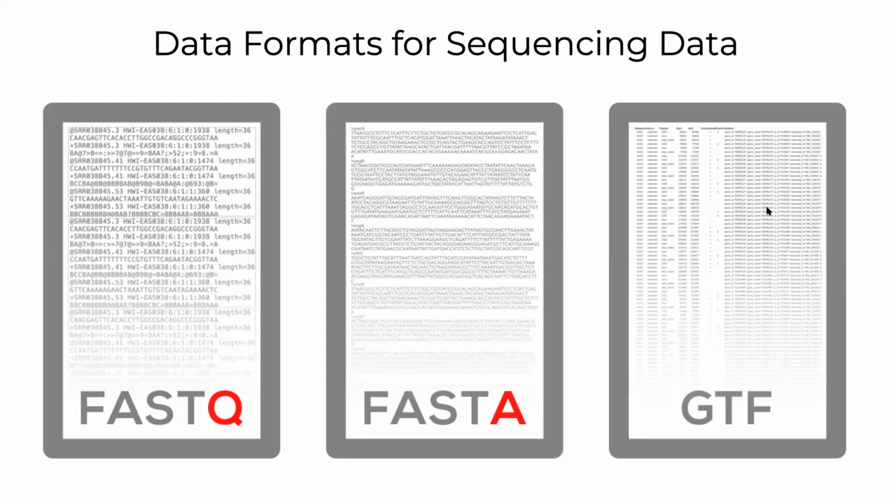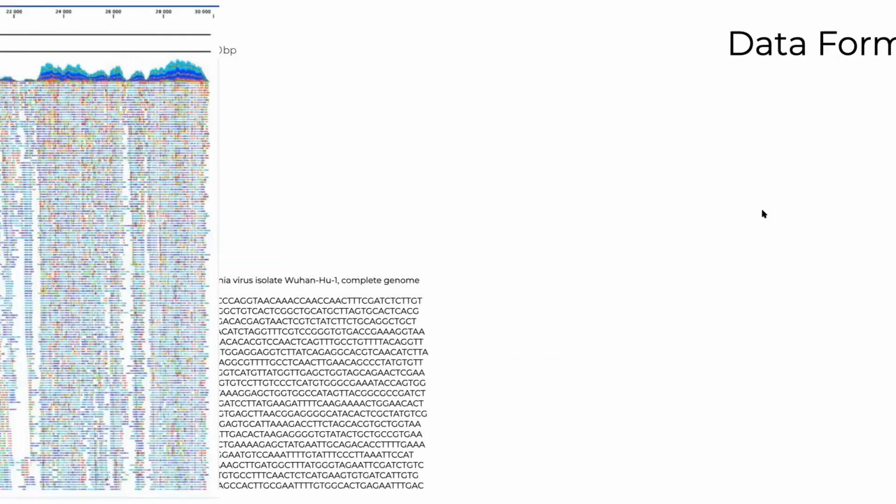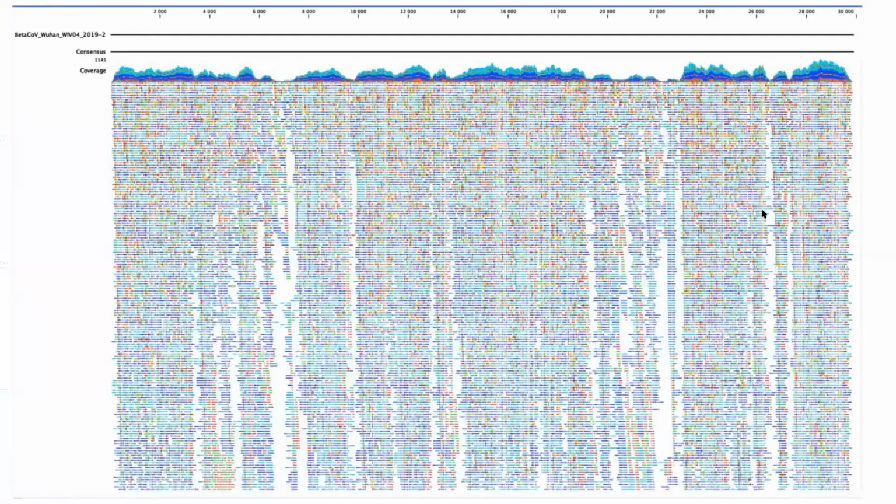When we are talking about SARS-CoV-2, the original genome from SARS-CoV-2 did not come out as a sequence of nucleotides already assembled. So when we first see the output of next generation sequencing, it looks like short reads. Each individual bar that you see on the screen represents a read.